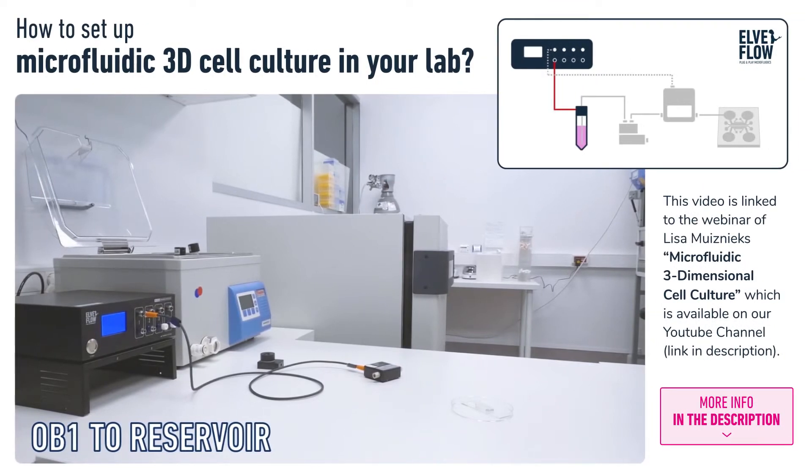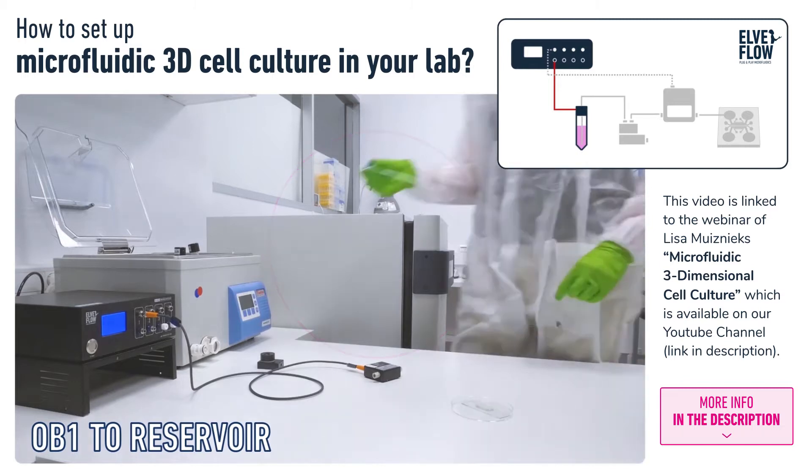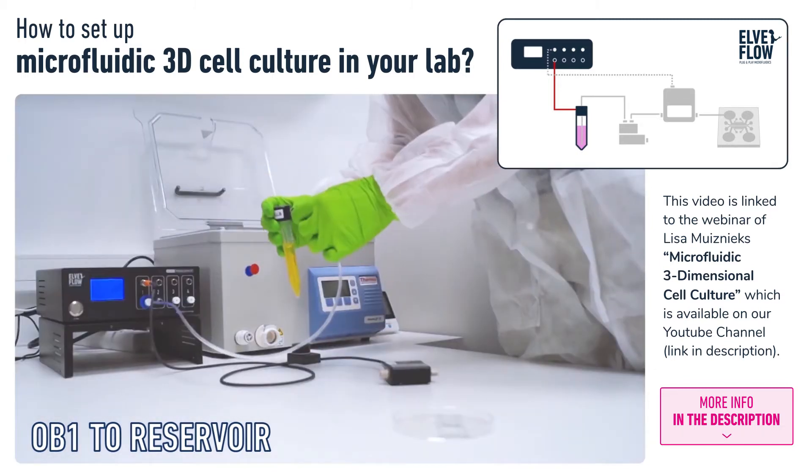We start with the OB1 pressure-driven flow controller on the bench. The OB1 is connected to a compressed air source. Next to the OB1 we have a heated bath to keep liquids at 37 degrees, and a CO2 incubator for the cells on chip.